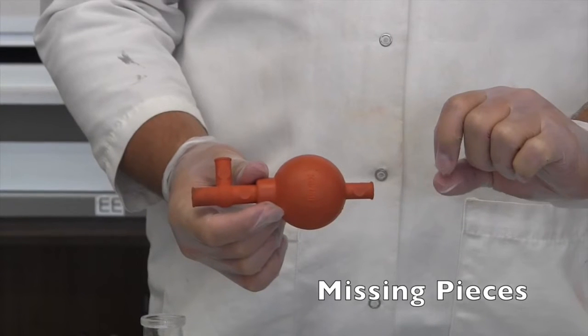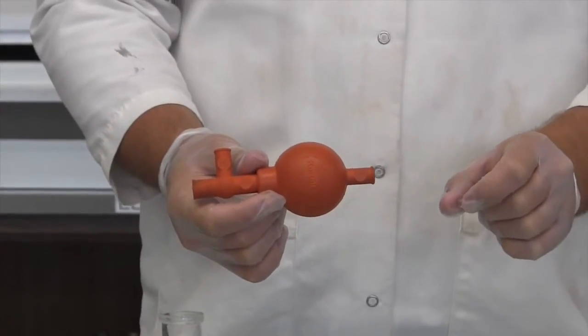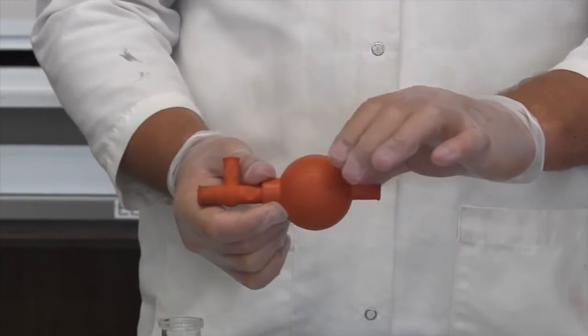Sometimes the small plastic balls that help seal each valve come out and get lost. If your bulb is missing one or more, tell your professor and get a new one. A bulb will not keep a vacuum if a plastic ball is missing.